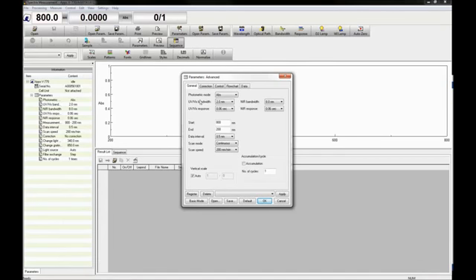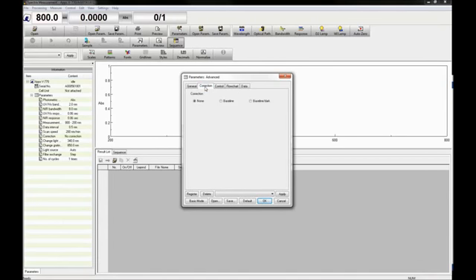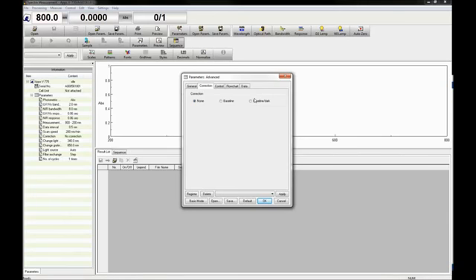In advanced mode, the correction tab lets you select whether to correct your absorbance data with no baseline, a baseline, or a dark correction. The dark correction measures the absorbance with the beam path blocked by a shielding plate. It is recommended for samples with high absorbances and cannot be selected when in basic mode.